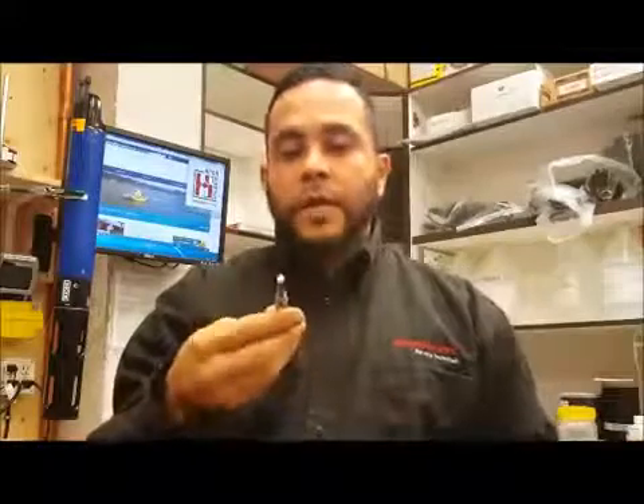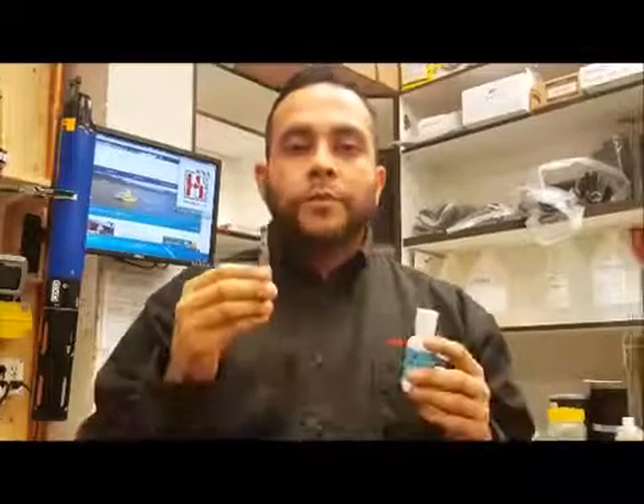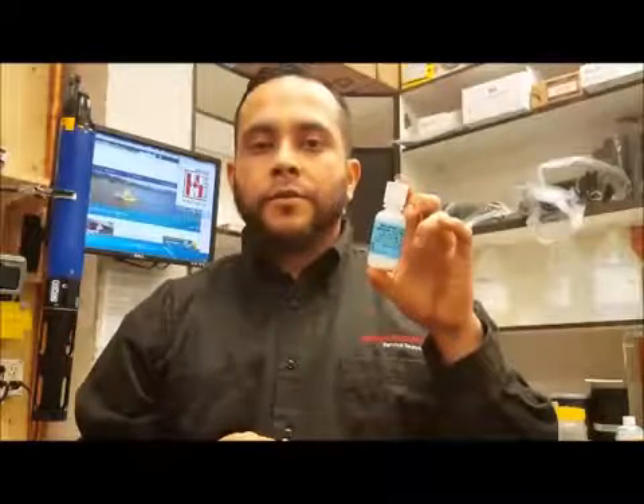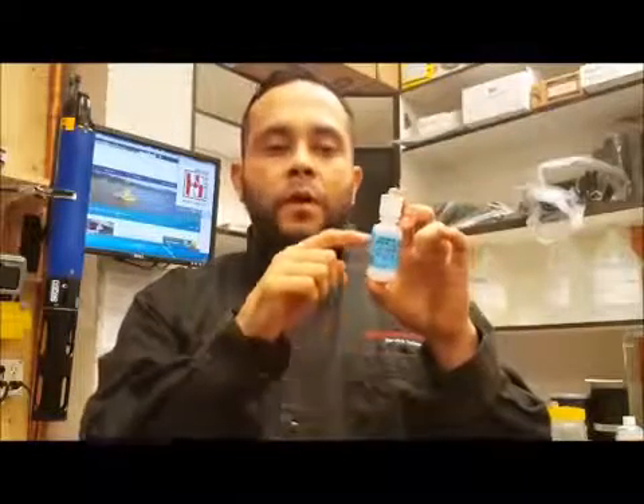Now we have a clean DO probe. You're going to want to mix the solution up. In every kit comes electrolyte solution crystals. Fill it up with DI water up to the bottle's neck and give it a good shake. When you have that solution ready, it is time to put it inside the membrane.